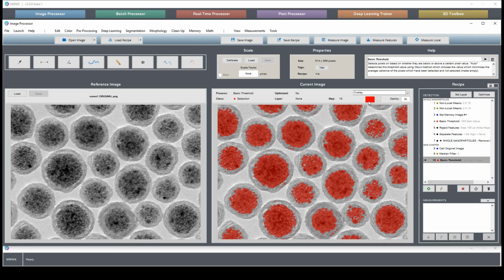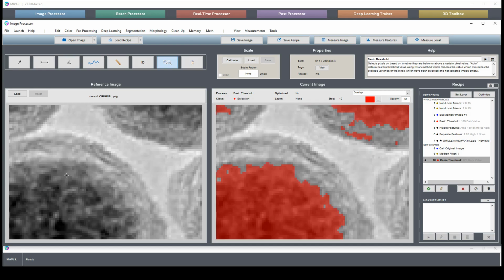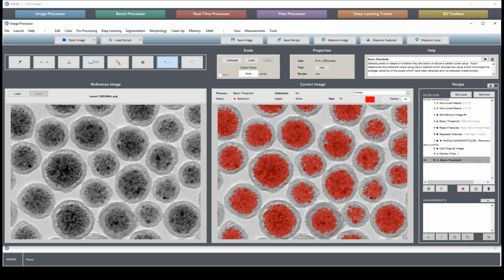And here also we have a decision to make. There's a lot of this roughness, this globularness around the outside of these cores. And we have to decide, is this real or is it not? Is this real variation in the size of the cores? Like, are they actually in real life jagged like this? Or is this just an artifact of the imaging, the intensity variation that we have here? So let's try it both ways.